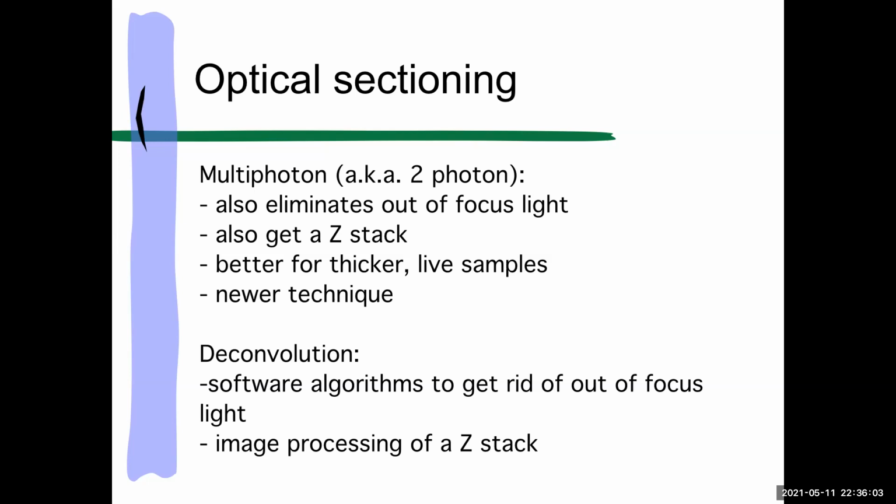photons are going to, simply put, run into each other. And because of the physics, when two photons interact in the same exact space, instead of 900 nanometer light, you'll get half of that. You'll get 450 nanometer light. And the advantage is that you are shining this red laser through your specimen. It will travel further into your specimen, and also it's very gentle to the specimen itself. It's a lot gentler than the higher energy, for instance, UV lasers that we use in confocal and so on.